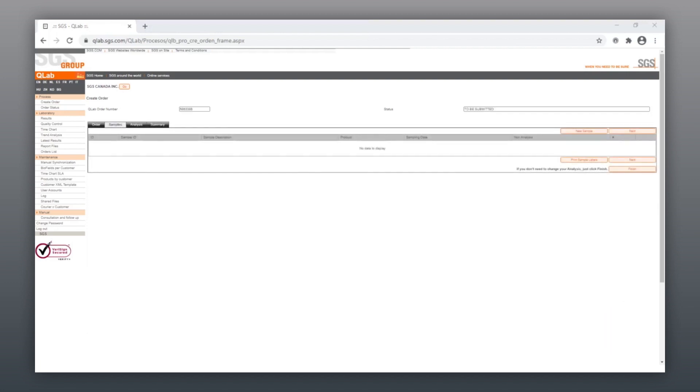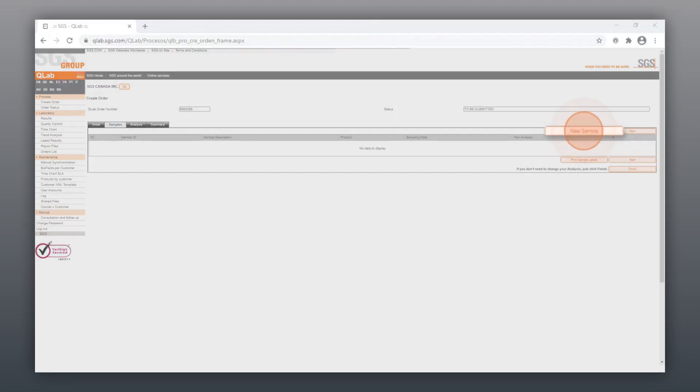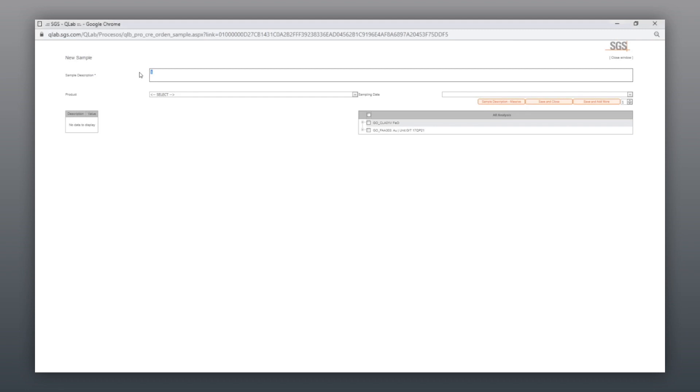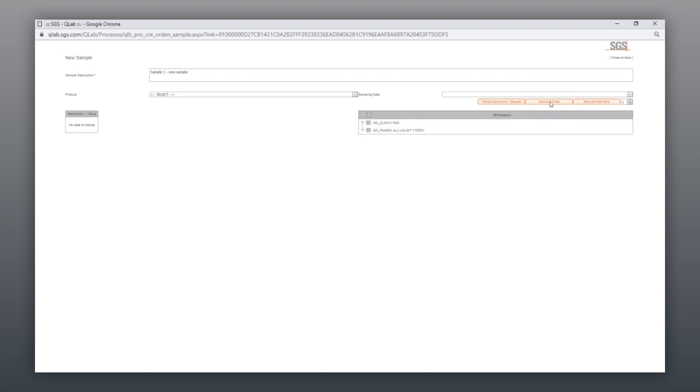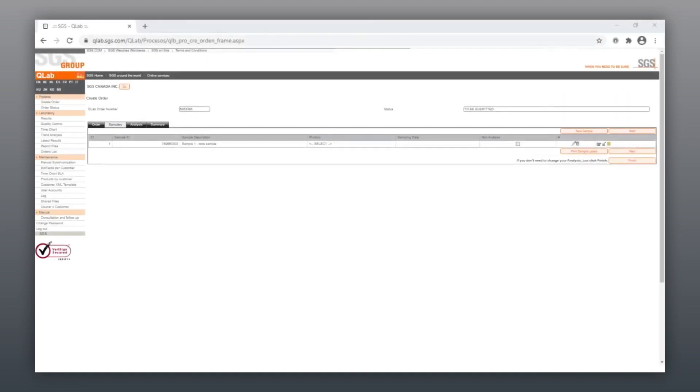Click on New Sample to enter the required sample data for each sample. Sample details can be edited as needed if required. Once your sample information has been inputted, click Next to move to the Analysis section.